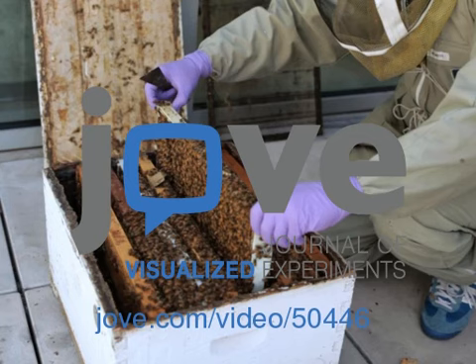After the injections, mark the bees with color-coded paint dots corresponding to the treatments and return them to a hive. 6 days later, VG and USP gene knockdown in the treated bees is validated by real-time PCR, and the effect of double VG and USP knockdown on gustatory perception is determined by the PER assay. Ultimately, double knockdown bees are shown to have significant reductions in the expression of VG and USP genes and significant increases in the gustatory perception to sucrose.